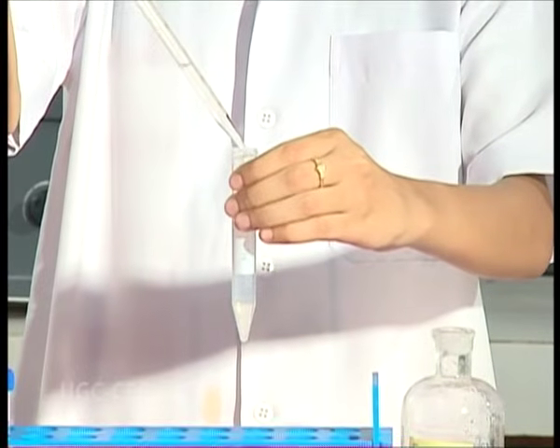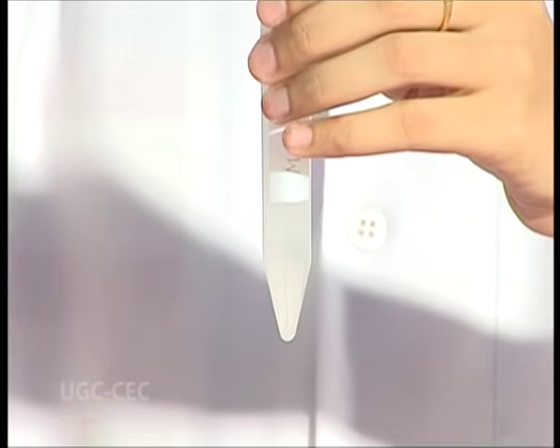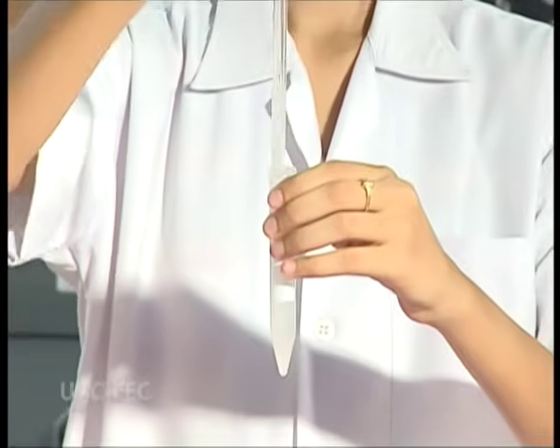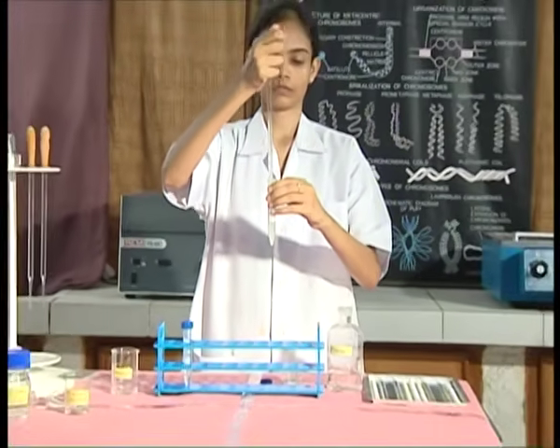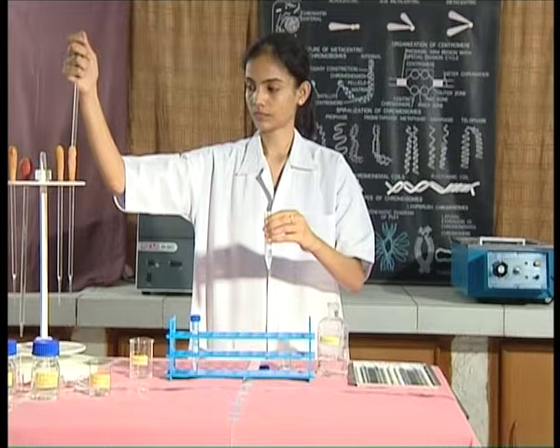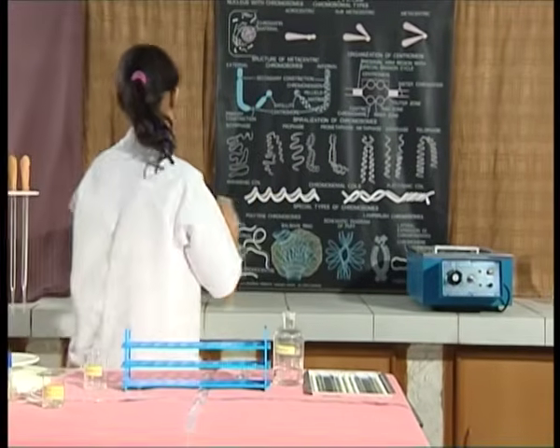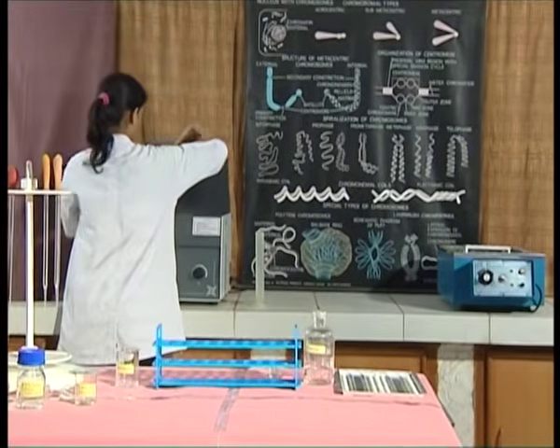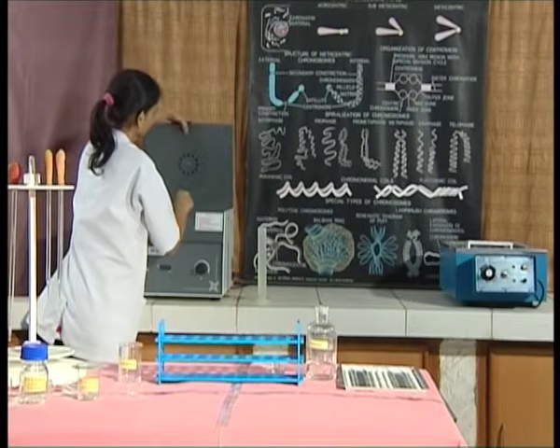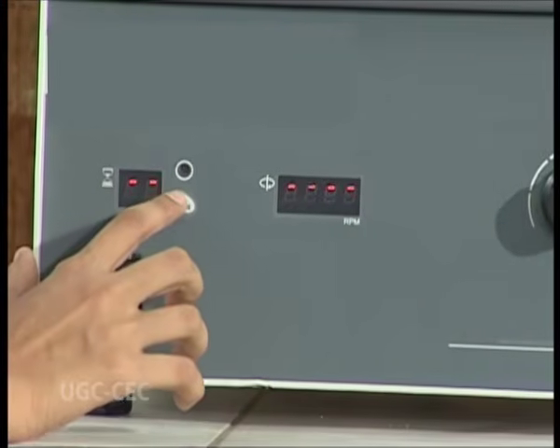Add 5 ml of the fixative to the tube and agitate thoroughly with the help of a pipette so that bubbles appear. Centrifuge the tube at 2000 rpm for 15 minutes.